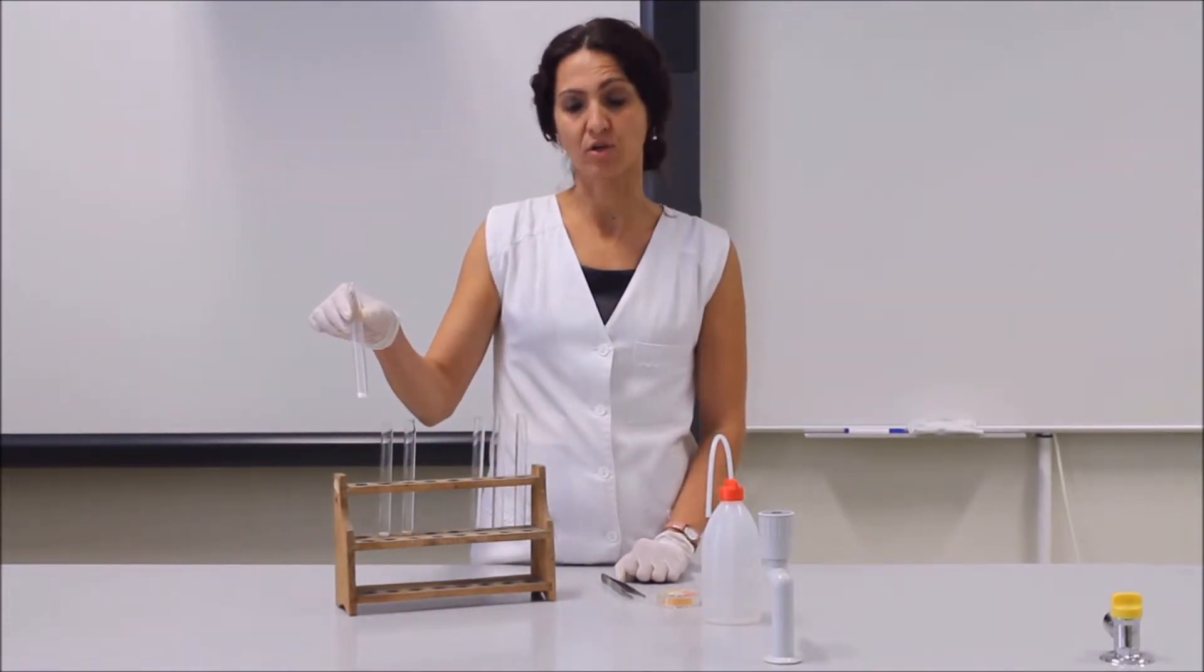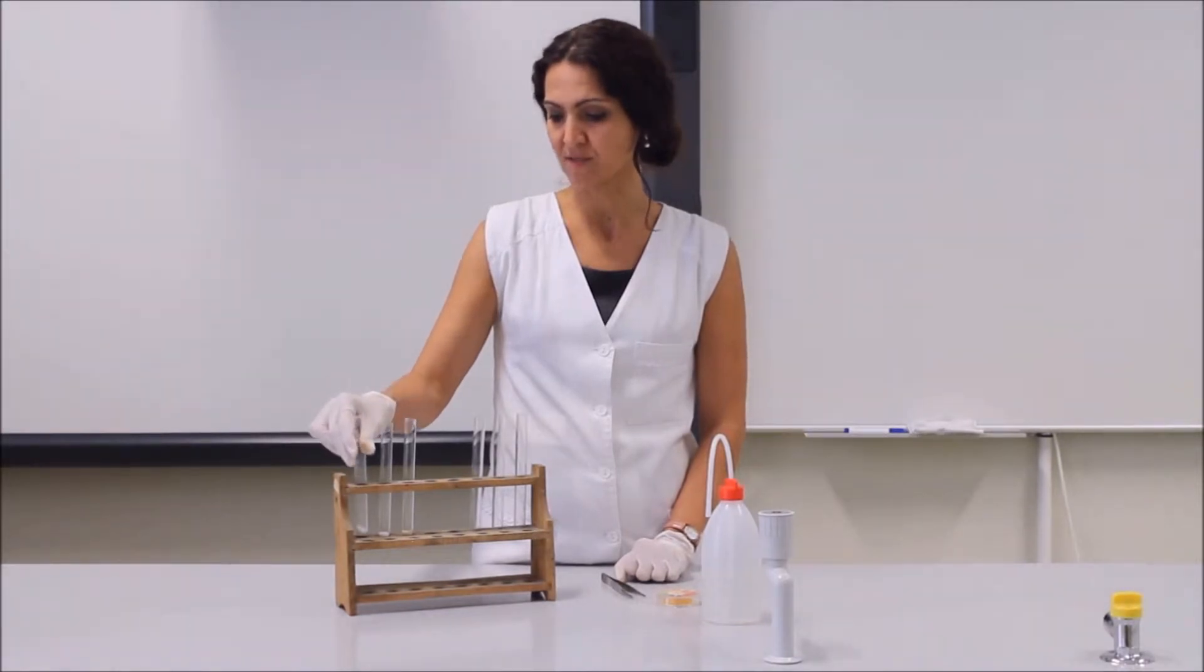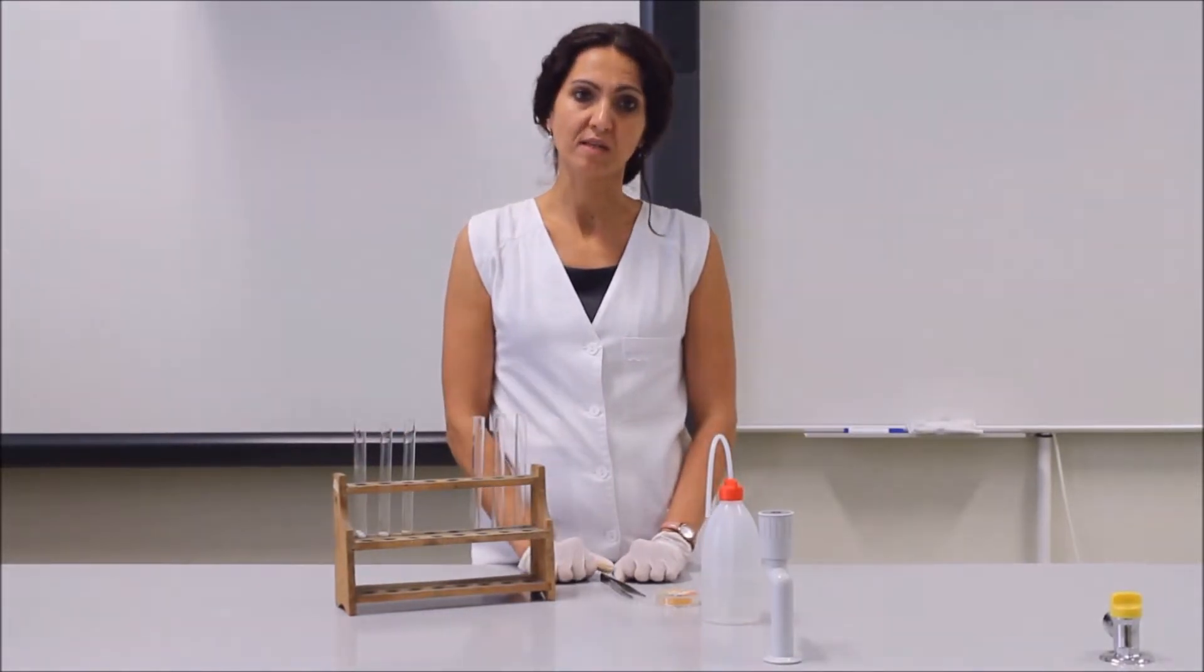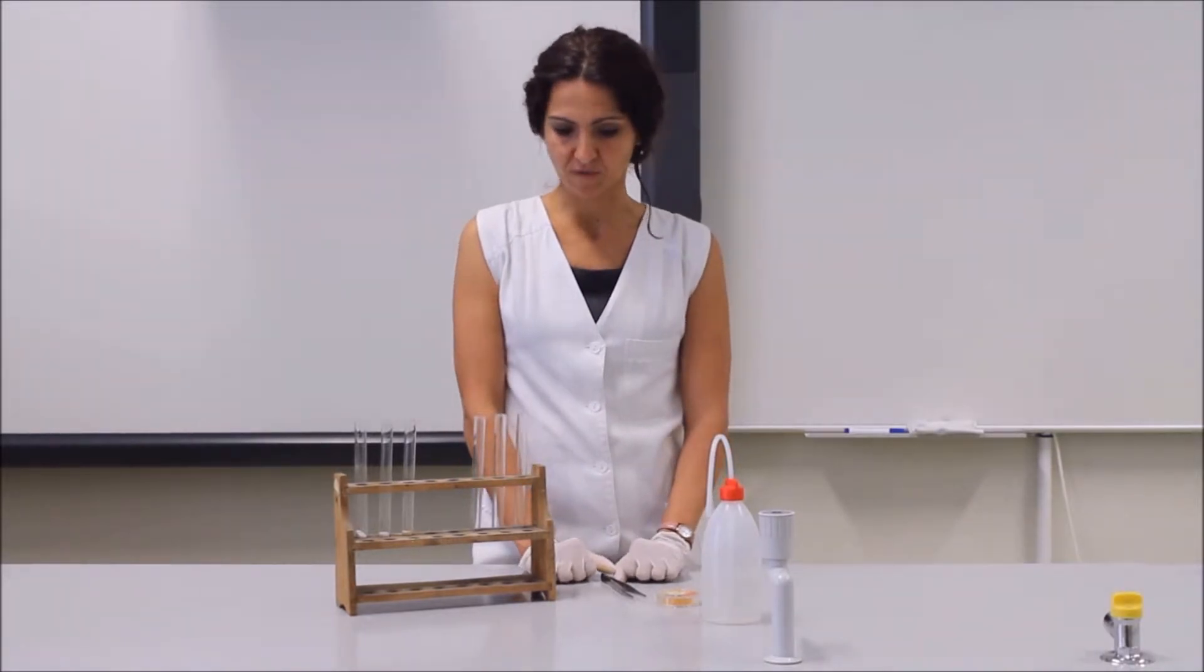In each test tube there is a white solid which could be one of the following: sodium acetate, glucose, and citric acid. The identification of these solids can be done using distilled water and pH paper.